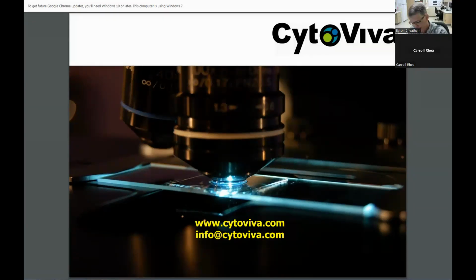Mm-hmm. All right, next from Soha, two questions. The first one, can we observe and measure the carbon dots with respect to the antibiotic resistance of the pathogenic clinical isolate at hand? Wow, that's a deep question. It is. So the carbon dots, I don't know, typically carbon dots are designed, as I understand it, that they can have unique spectrum based on how they're designed. But I'm not sure about these.